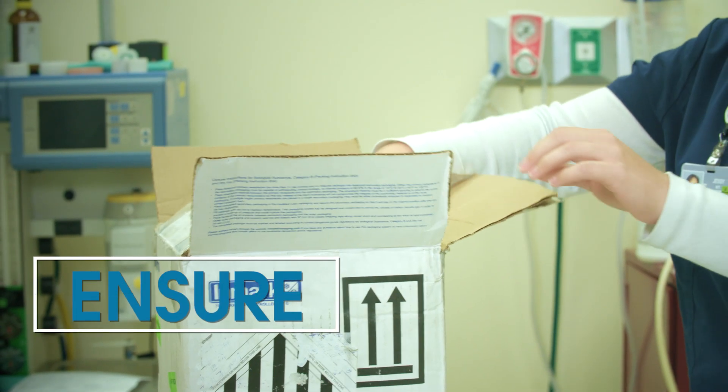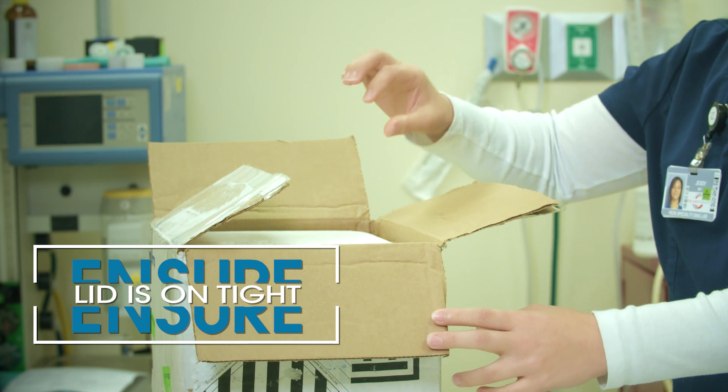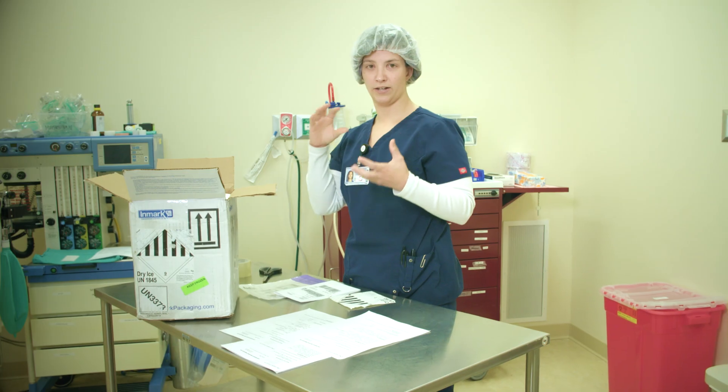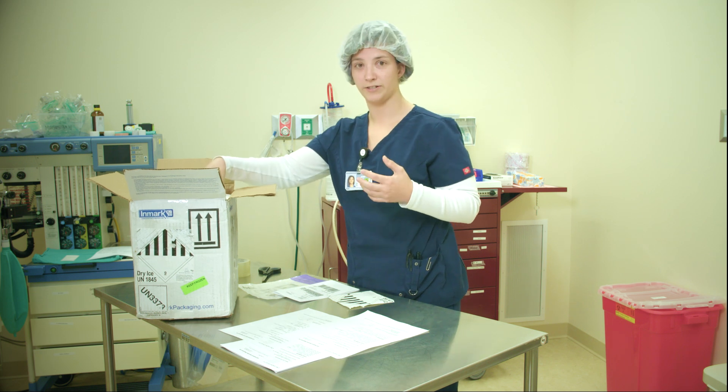Close the styrofoam box and make sure the lid is on tight. Sometimes dry ice can get stuck between the box and the lid, not creating a good seal. So make sure it's on there tight.